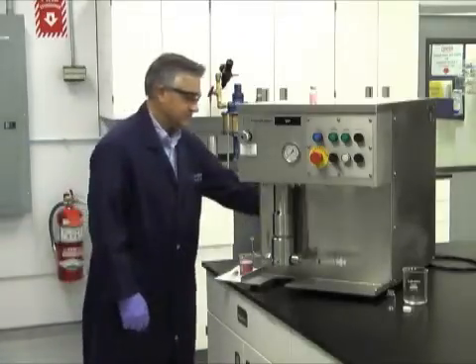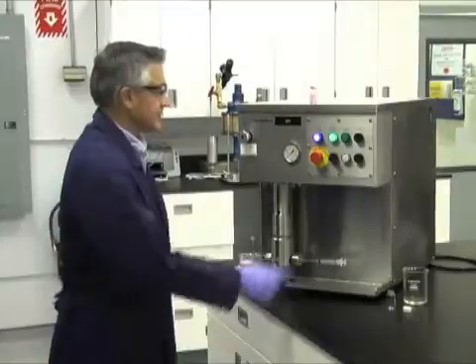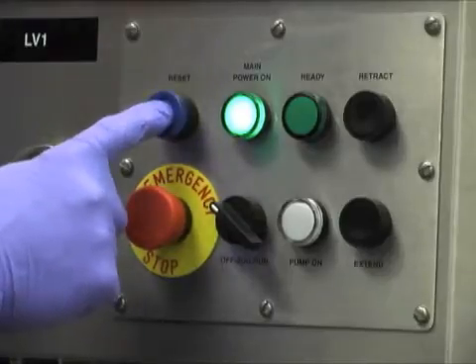The first thing we do is turn the power on. You'll notice the main power on and reset buttons light up. Once that happens, press the reset button.